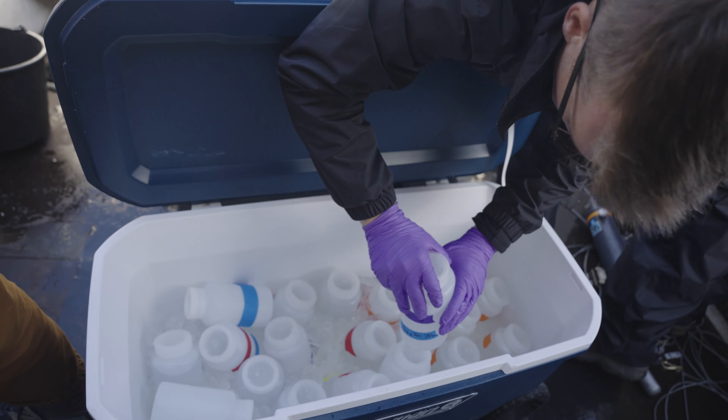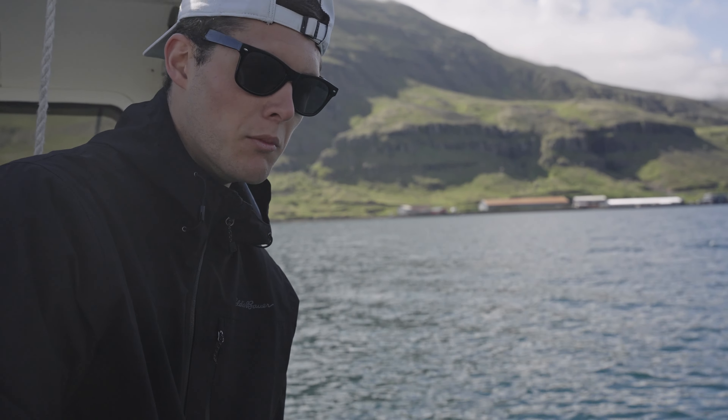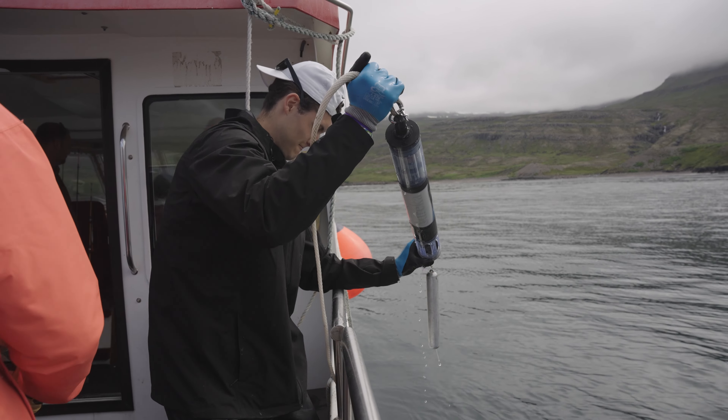Then we open up the spigot and the water will come out and we collect it. Right now I'm using the Sonde probe — basically what it does is read a bunch of levels in the water: turbidity, pH, salinity, stuff like that.